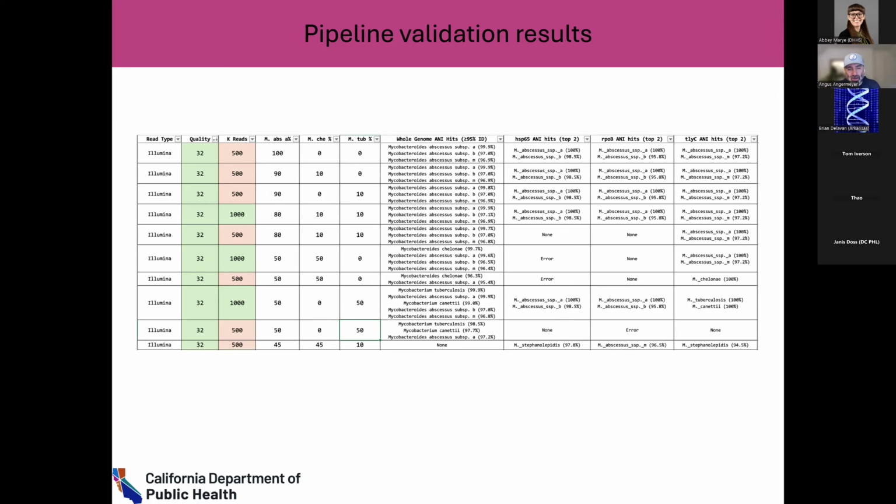So the main point here is that obviously there's work to be done. And I really want to bias this model and the thresholding in a way where, when mistakes are made, we err on the side of false positives, which are still not great, so I'll try to minimize those as much as possible, but really, really try to avoid false negatives, since these are clinical infections and they're often quite serious, and the clinicians need to know what's going on as soon as possible. And so hopefully we won't miss something that's medically important.